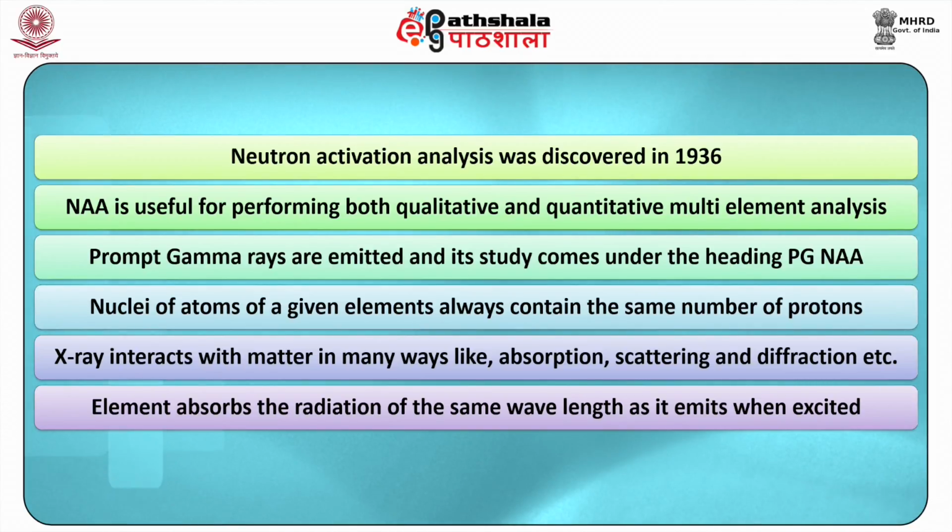X-ray interacts with matter in many ways like absorption, scattering, and diffraction, etc. Atomic absorption spectrometry works on a simple principle, that is, an element absorbs the radiation of the same wavelength as it emits when excited.